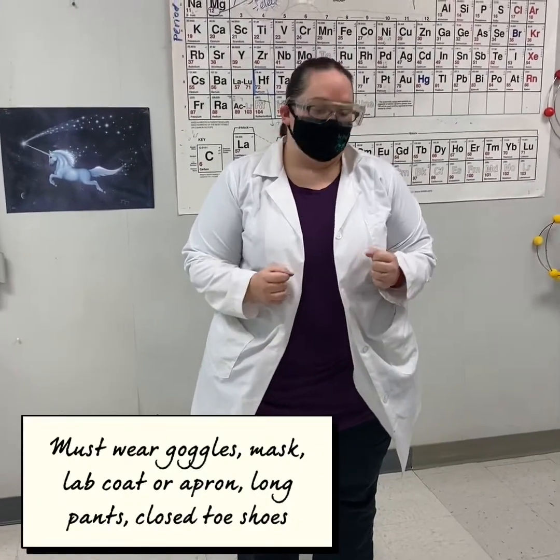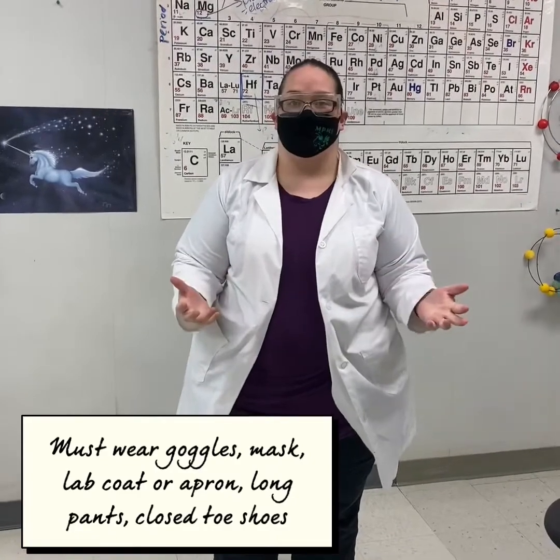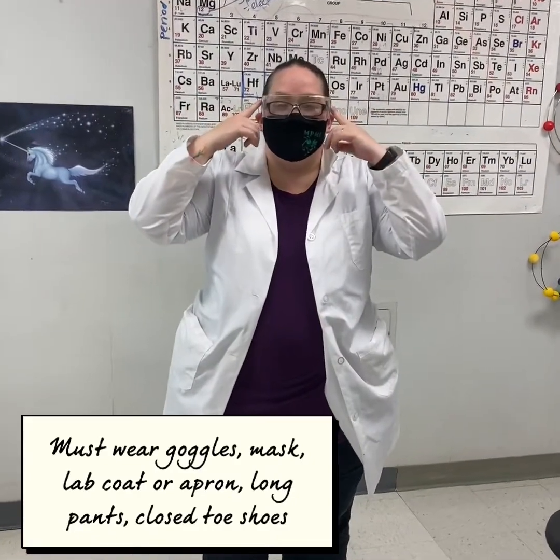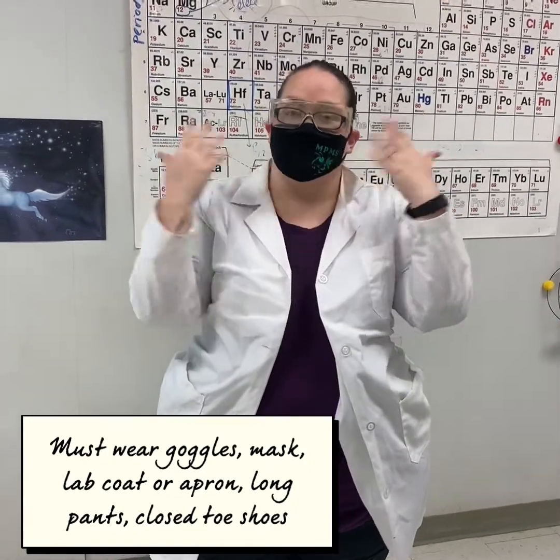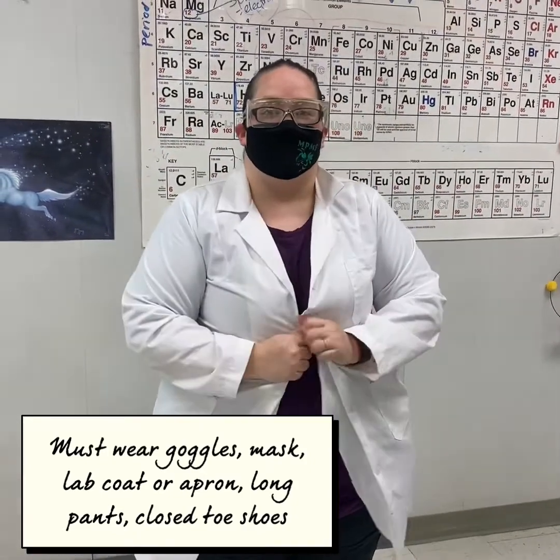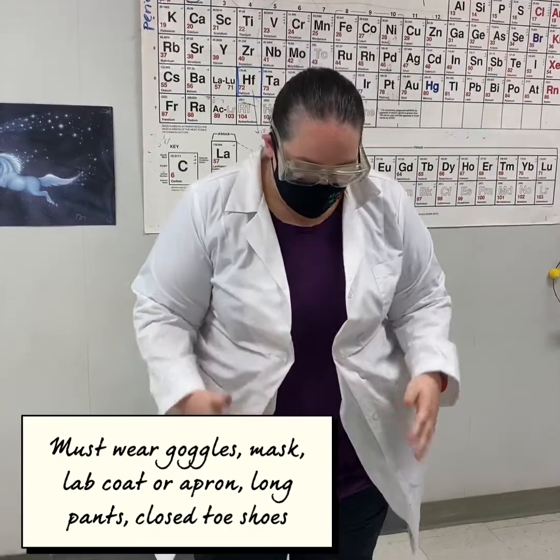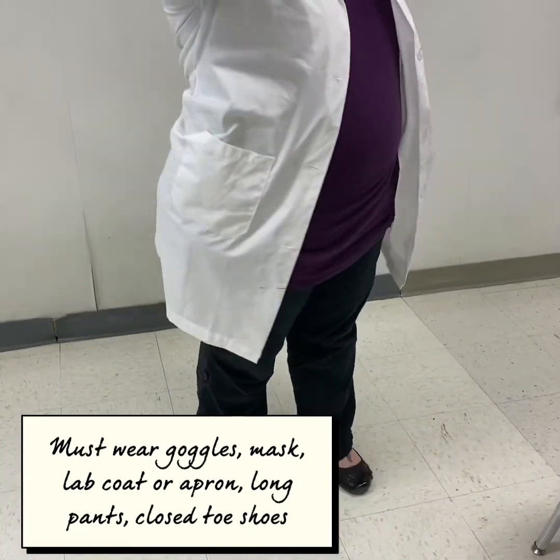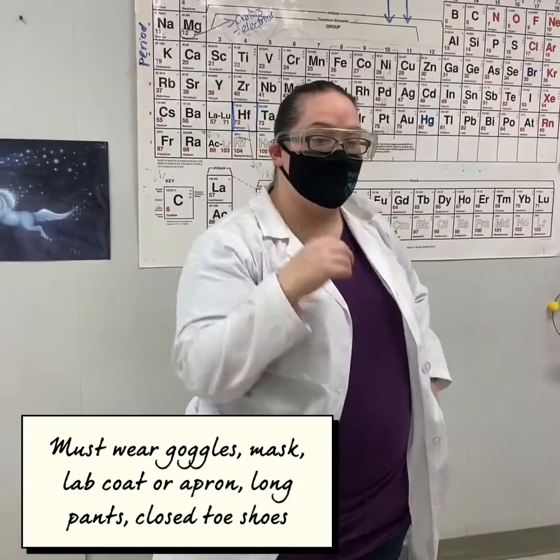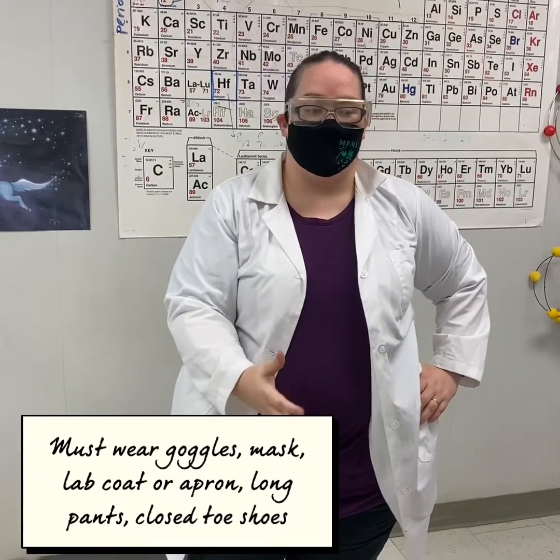All right, today I'm going to be talking about proper lab gear to wear when we're doing our lab. You must always wear your goggles to protect your eyes. We have our mask for COVID. We have our safety coat. You'll have an apron. I have pants on and closed-toed shoes. I also have long hair, so my hair is tied back, and I have nothing around my neck that could fall forward and hit any of the chemicals.